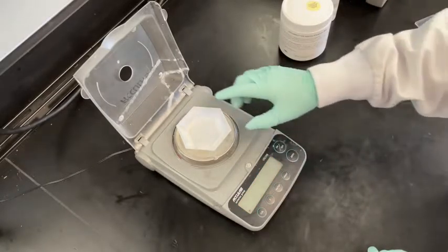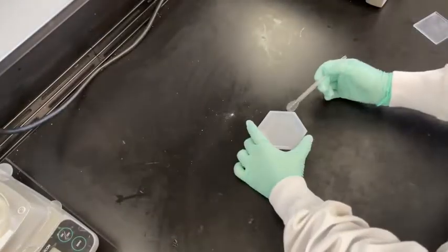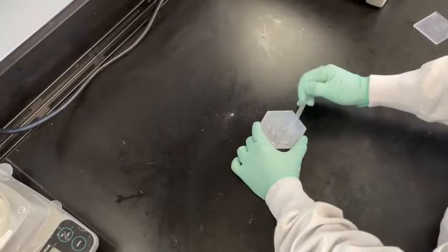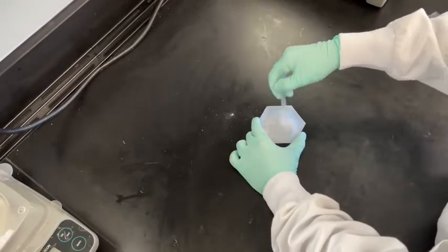Remove the bowl from the scale and turn off the scale. Take a plastic disposable stirring rod and mix the PDMS and the curing agent together. Stir the mixture vigorously for around 5 minutes to ensure sufficient mixing between the curing agent and the PDMS occurs. You will see bubbles near the mixture's surface.